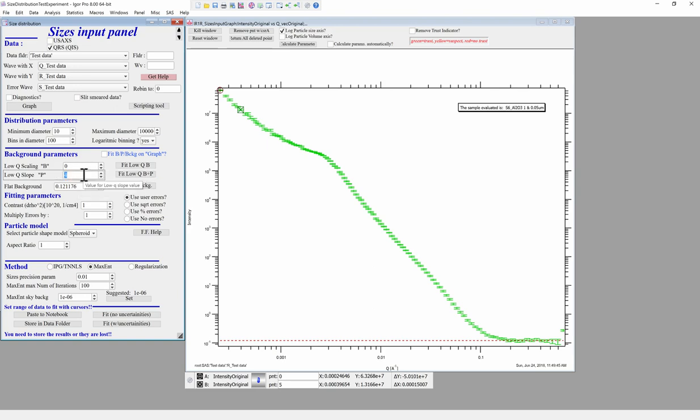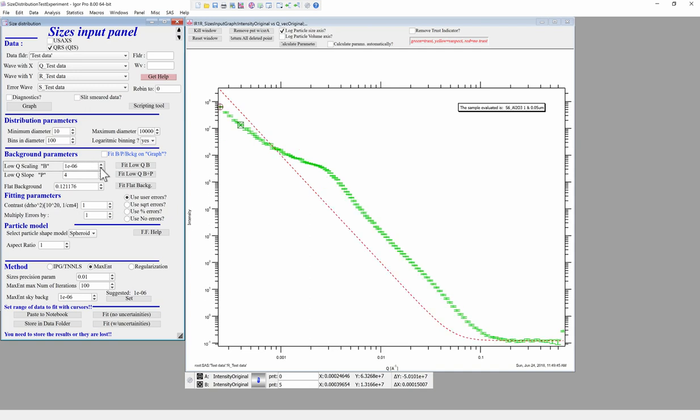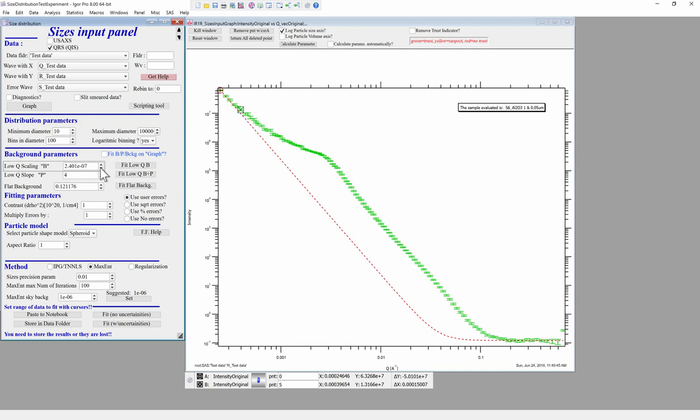So if we make the assumption that Porod's law is obeyed, presuming the sample has smooth surfaces inside, which come from something really, really large, then we can keep the P at 4 and then have something here, and you can see what it does. It puts a power law slope here, and I can do minus 6, and I can keep going down, for example, like that. And with this, I have already dialed up the numbers which I want to have here, and I'm basically saying these data, this small angle scattering in this area, is sitting on top of this background here. And there is some scattering coming out of the low Q, which is represented by this power law slope. In order to do this correctly, I need to know what the source of the power law slope is. And as I said, I presume in this case there are some large rocks which have relatively smooth surfaces, so there's some specific surface area coming out of that.